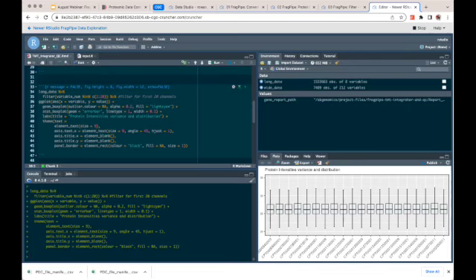We have a question on the chat. Could you clarify if that's for Rowan or for Dr. Yu? It says, this is very similar to the previous implementation of FragPipe. What is the difference? For Rowan. Honestly, I'm not an expert on the FragPipe, so Dr. Yu could probably speak up about the latest version. I know there is a new version that we're hoping to get on the CGC, but I don't know the differences between this and the previous one.